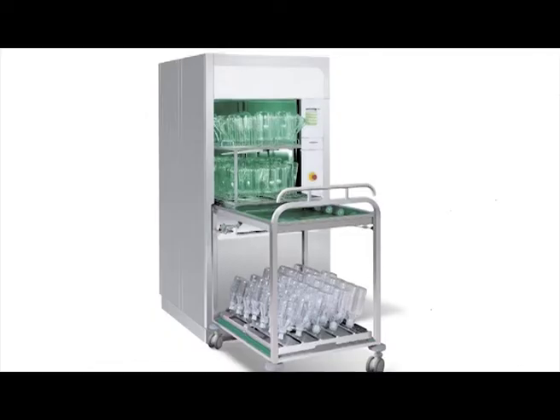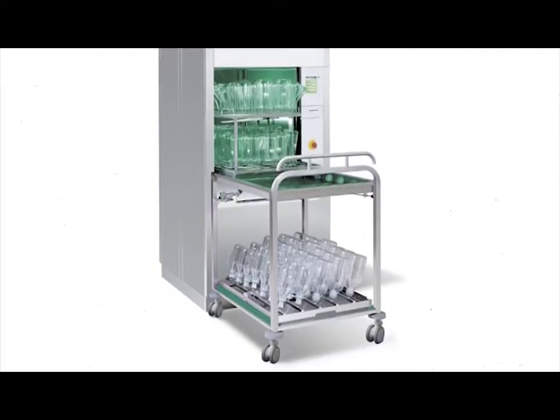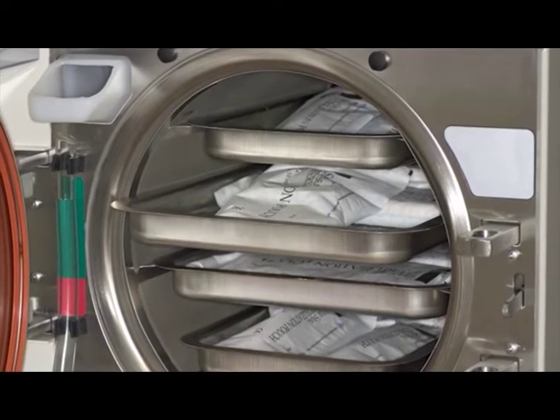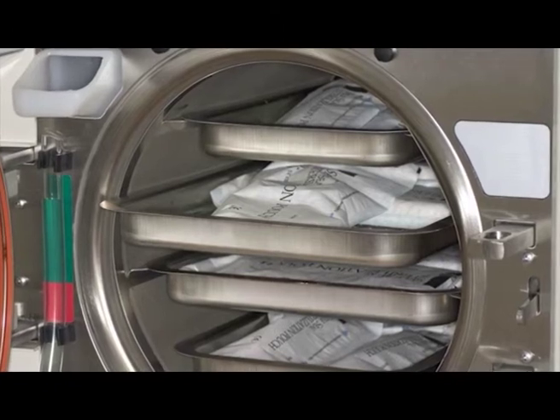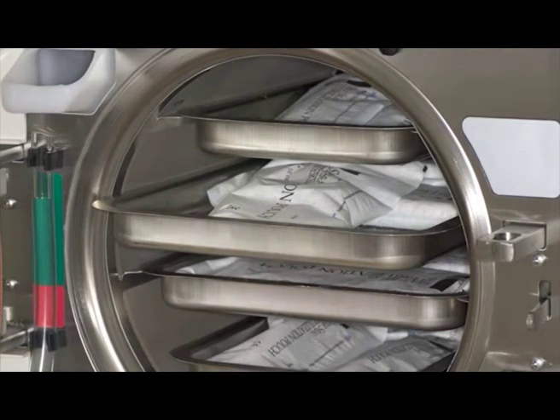Benefits are: the most dependable systems available for the decontamination of laboratory waste and the sterilization of laboratory glassware, media and reagents. The applications of this method are: for porous loads, dressings. Sterilizers are generally operated at a minimum temperature of 134 degrees centigrade, and for bottled fluid, sterilizers employing a minimum temperature of 121 degrees centigrade are used.